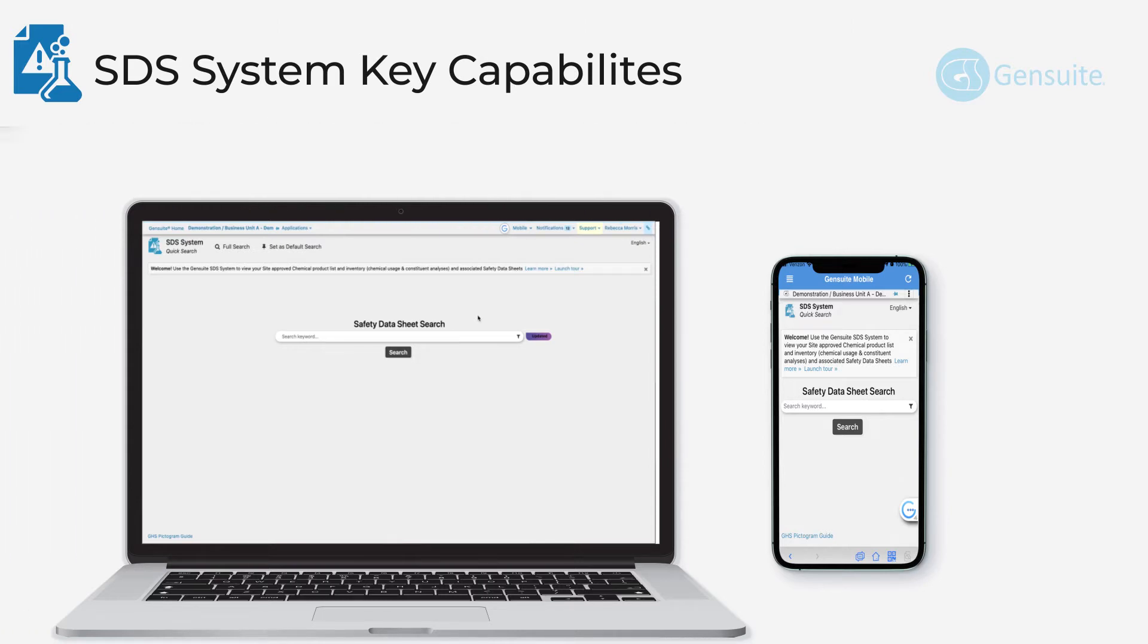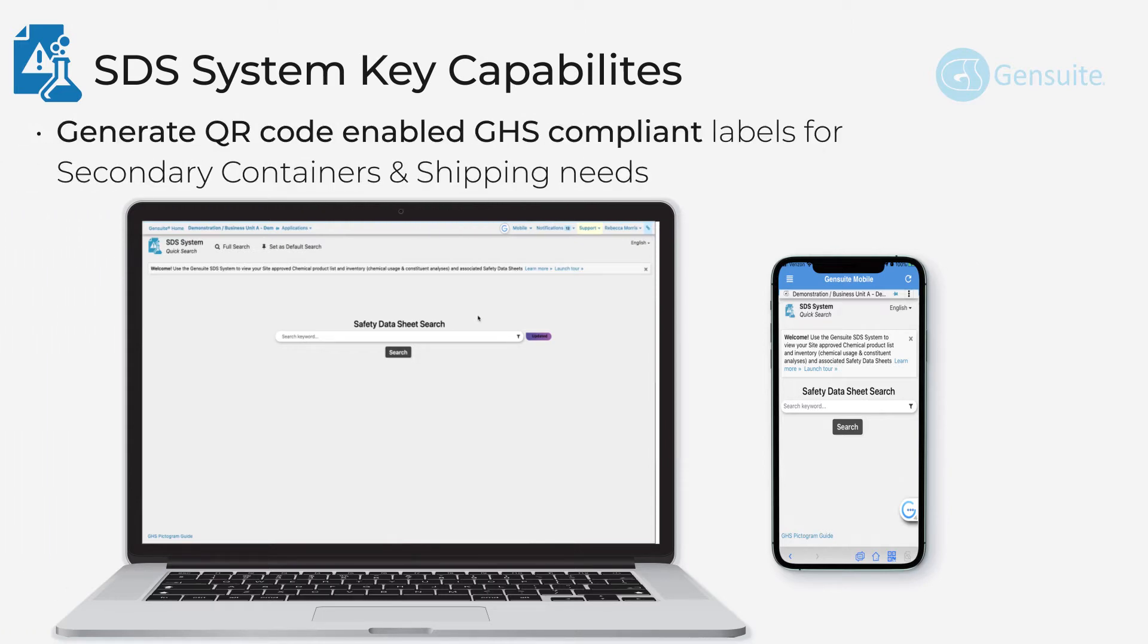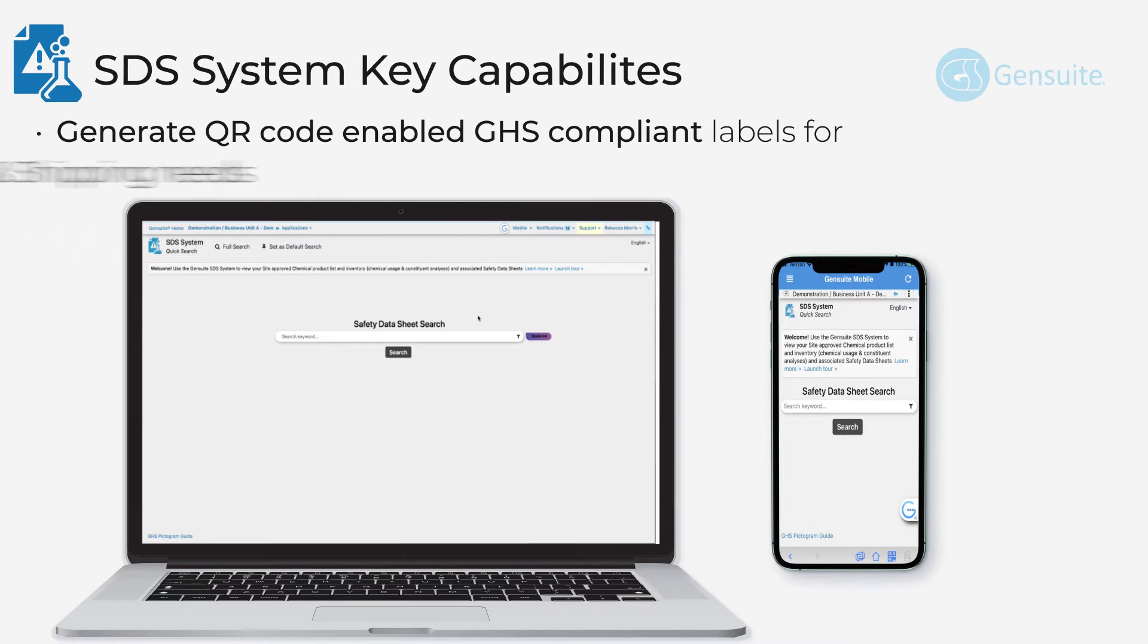The ability to generate QR code enabled GHS-compliant labels for secondary containers and shipping needs.